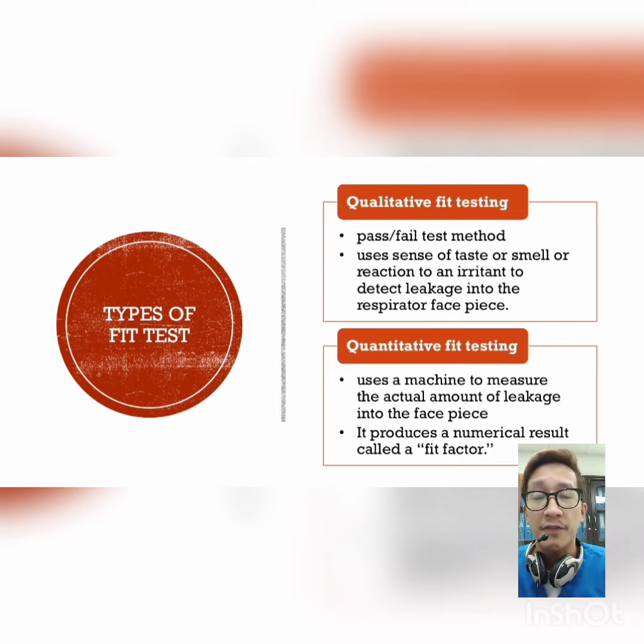The other type of fit test is quantitative fit testing. It uses a machine to measure the actual amount of leakage into the face piece and does not rely on sense of taste, smell, or irritation to detect leakage. It produces a numerical result called a fit factor. A fit factor of at least 100 is required for half-mask respirators.